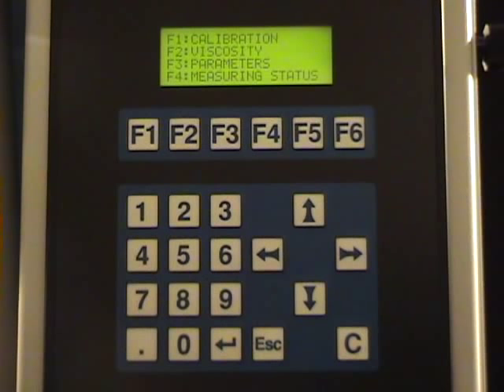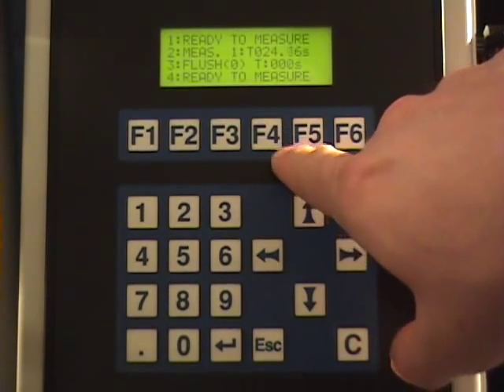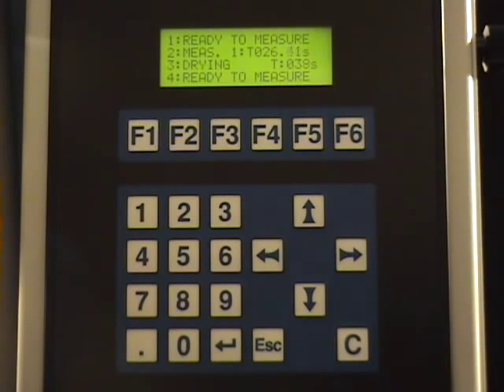The clear LCD screen plus keypad give the user access to a very intuitive control menu. From the main menu, tubes can be easily configured for standard viscosity mode or calibration mode. By pressing F4 from the main menu, the user is presented with a status overview of all tubes indicating their current activity.